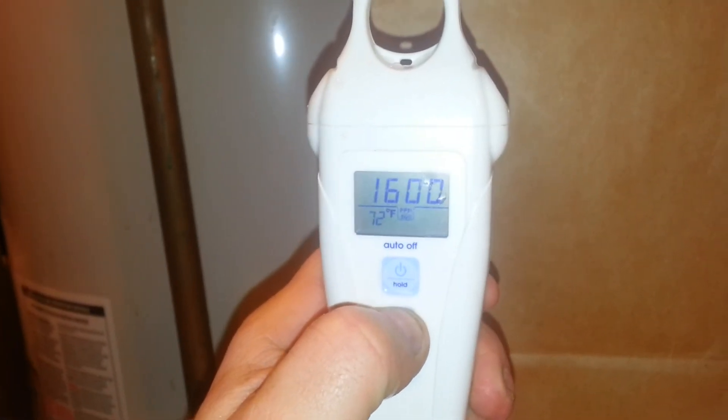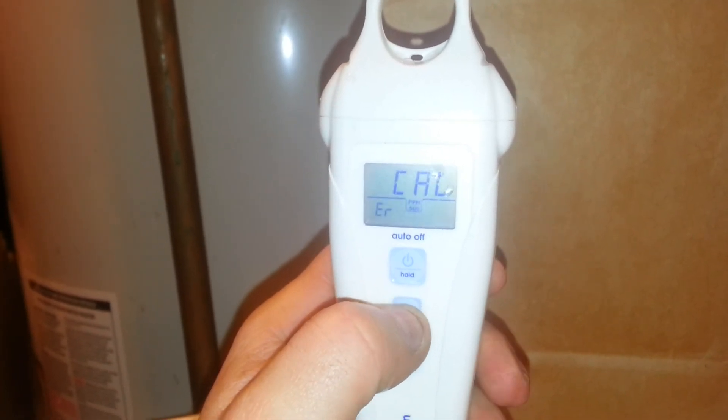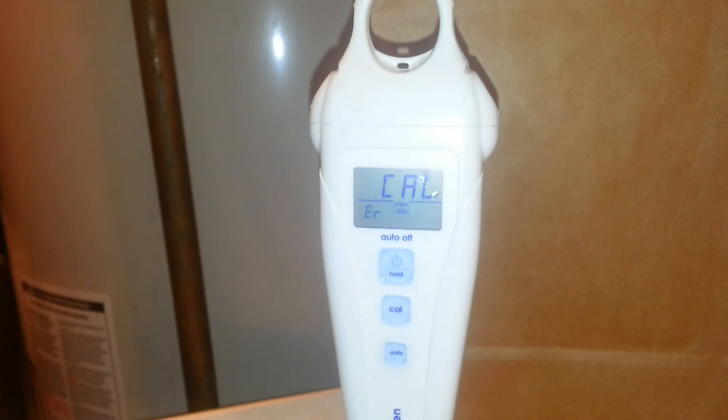1500 ppm solution, and I'm getting 1650. Which is probably not a bad thing. That's interesting.